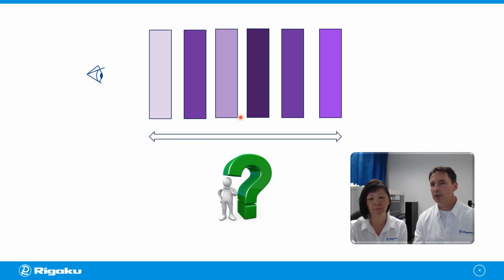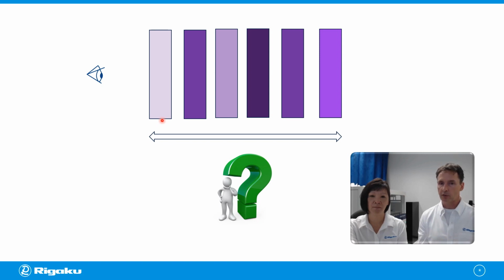So now here's a case where we were doing the red and the blue, but now all of a sudden we have some purple sample that maybe is a combination of the red and the blue. What we're trying to illustrate here are the two main things we have to take into consideration for X-ray fluorescence, which is a direct analysis technique, as opposed to something like chromatography where we're separating out the materials and then looking at them. Here, we're not going to bother doing that, which is a real benefit, but we then have to take into consideration that all these things are together in the sample, and how do we differentiate them while they're together. So we have two things that we have to worry about.